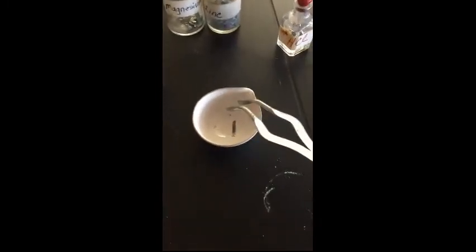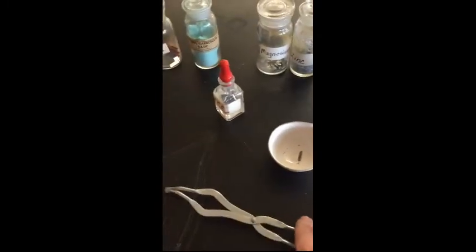I'm going to take this and put it into the evaporating dish. Let me show you a piece of copper that has not been burned, so you can make that observation in your data table. Okay, here's before, here's after. You can see that it's pretty well burned.